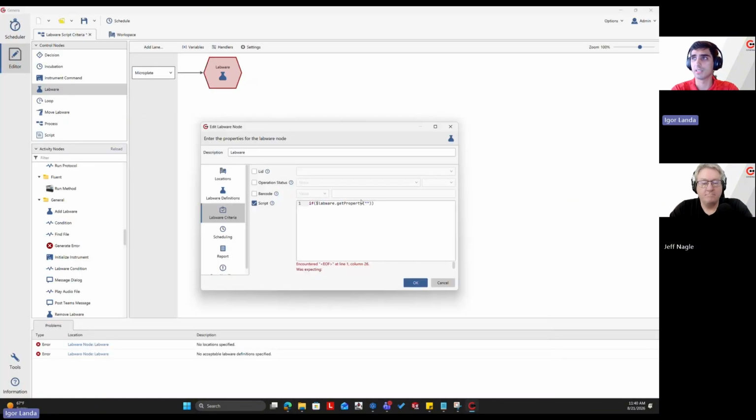We're going to do that in this case, and then we're going to have reagent type, because that's what the property is called. Then we're going to use dot equals, and we're only going to be looking for buffer B values. The last thing we have to do is return true. Now, this buffer type is the one we're looking for.